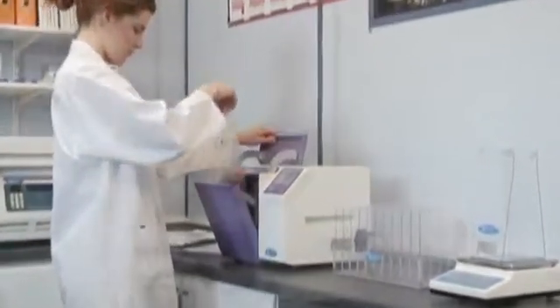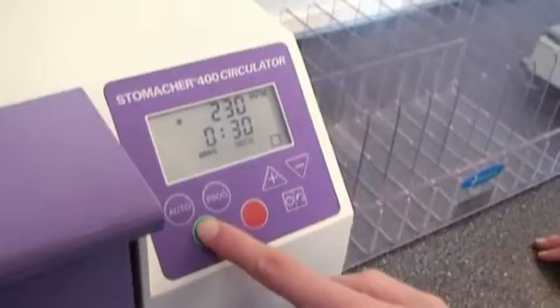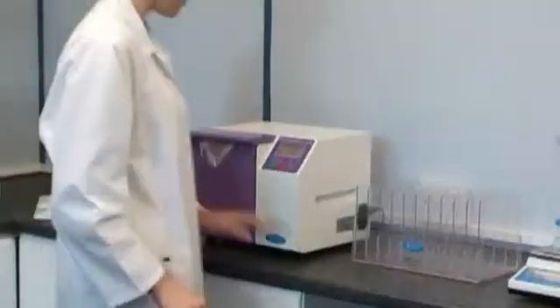Complete with easy to use digital display, the control panel allows simple adjustment of processing time and paddle speeds, with auto-run and programmable features.